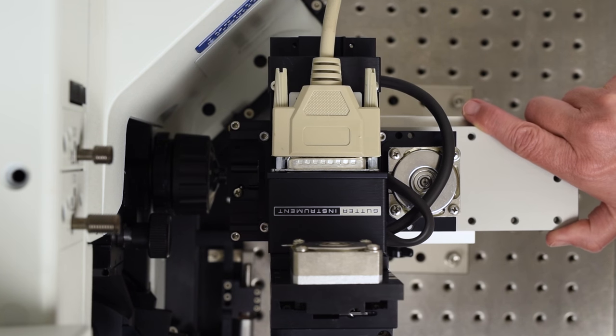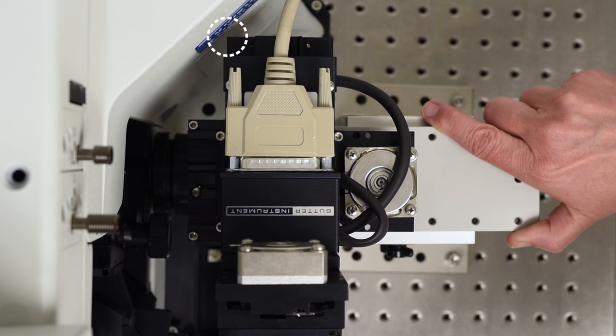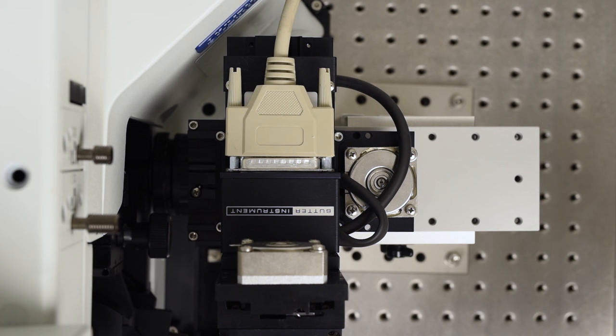In our example, you can see that when moving the manipulator in the X axis, its path is obstructed by the wings of the microscope. In this case, the solution to this issue is to use our right angle adapter.